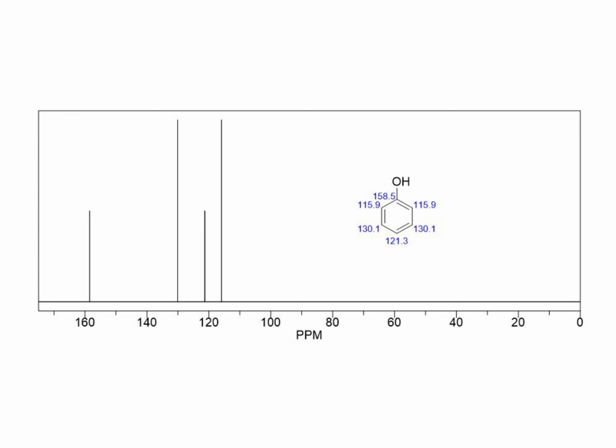Then again the phenol group, as you can see here. How many environments will you have? One environment, two environment, three environment, four environment. So four environments means four peaks. Within the four peaks, one is CO. CO means it would be around 150 to 200.